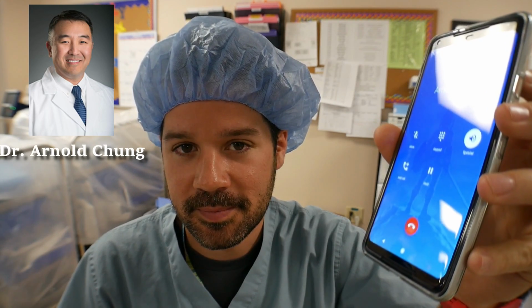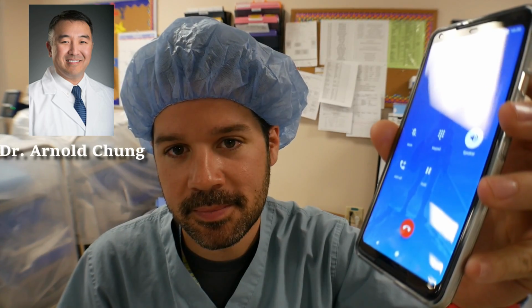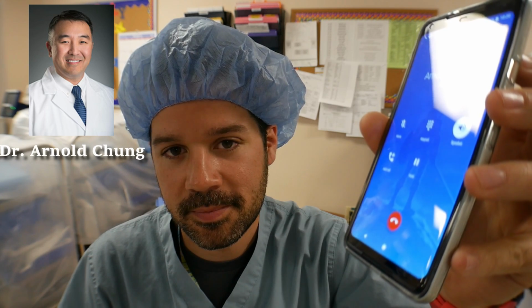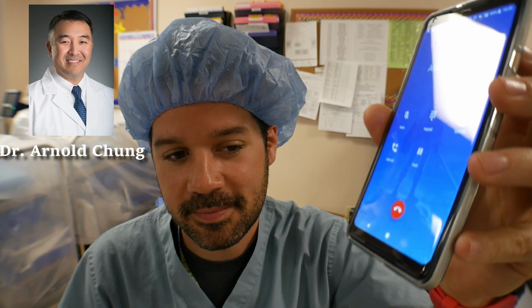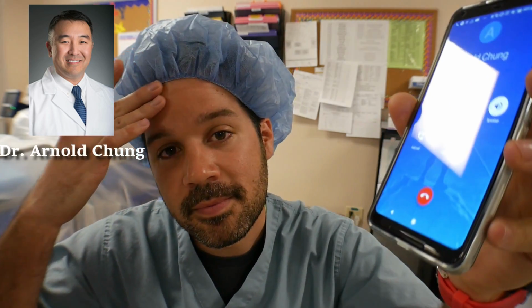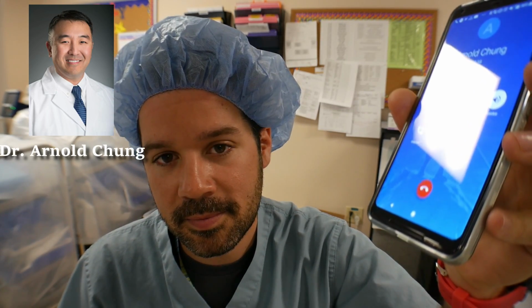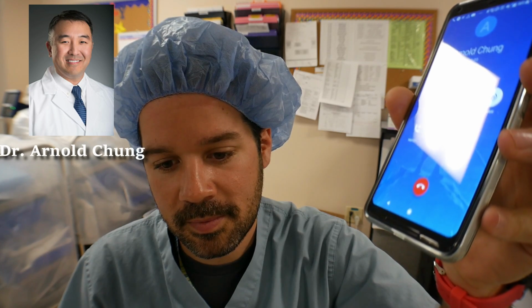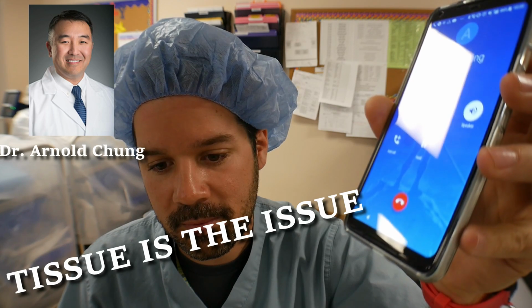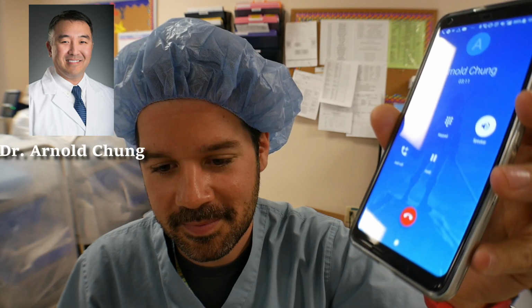So in terms of specimens, basically it's the problem of diagnosis. Sometimes a patient has a problem, but we still don't know what the problem is. If they have a mass in their lung or something in their breast, it's causing a problem, so we need to figure out what the issue is. The best way to do that sometimes is to get a piece of tissue and send it to the laboratory for analysis. There's a saying, tissue is the issue, meaning sometimes you have to get a piece so that we can understand what's bothering the patient.